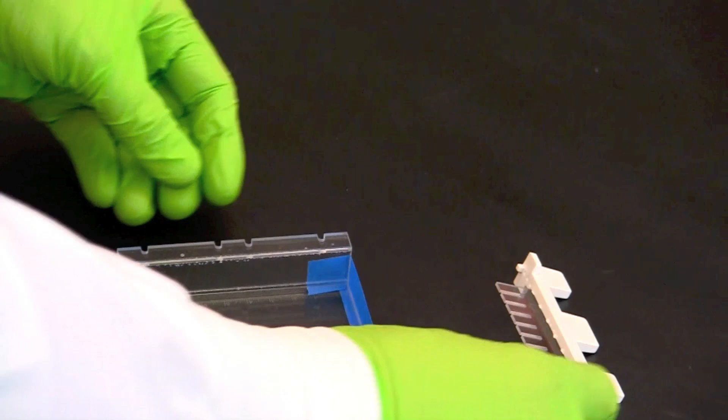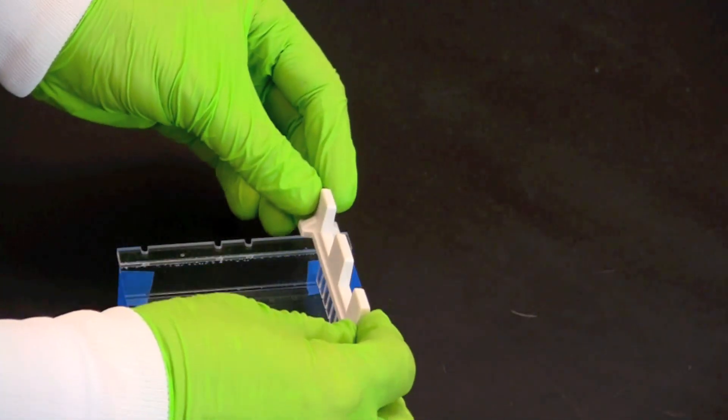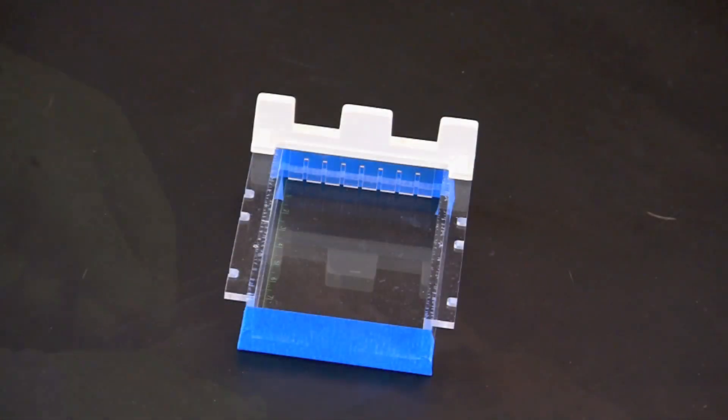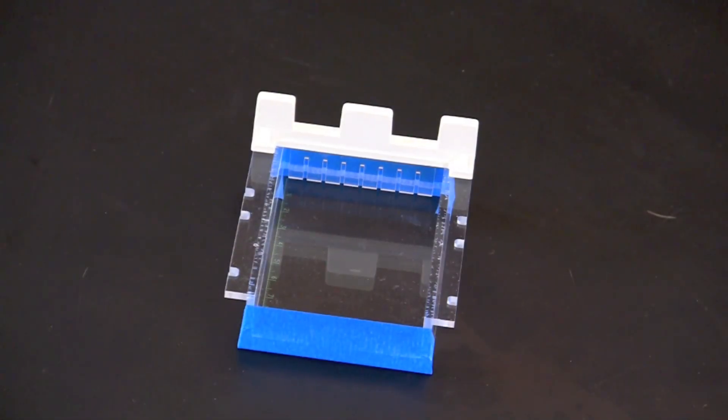Next place the comb into the comb guides on the gel tray. If you plan to run DNA samples the comb should be placed at one end of the gel tray. Place the tray with comb on a flat and level surface.